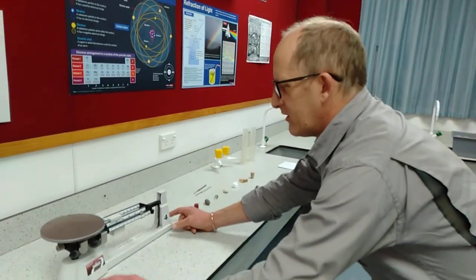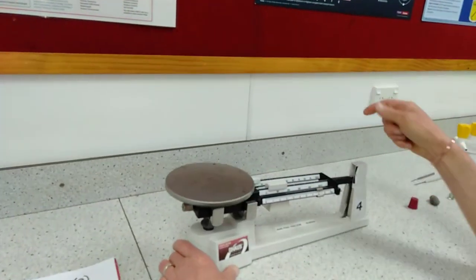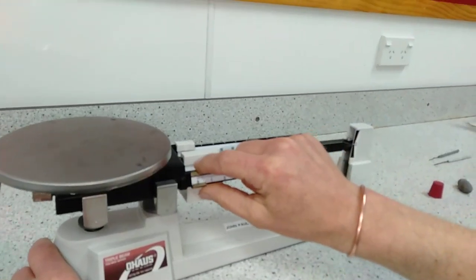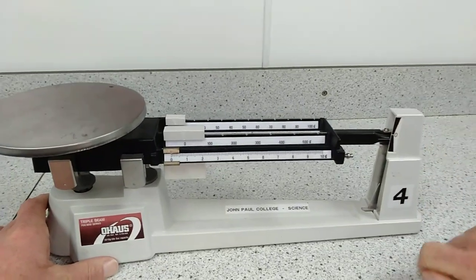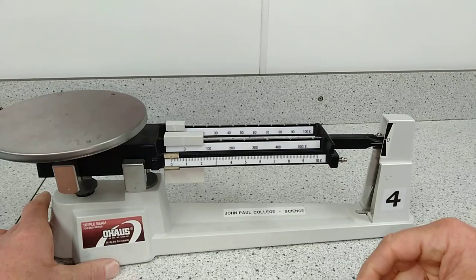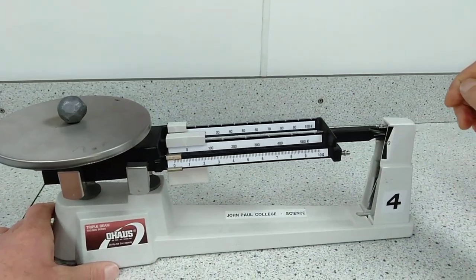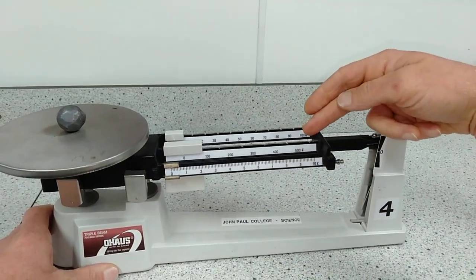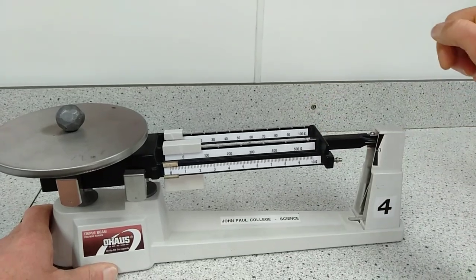To get the mass of the lead, we need to make sure that our balance is on 0 and we have the measurements aligned with 0 on this side, or at least very close to 0. We put the lead weight on and we note that it pushes it down. We need these balances, which we use the hundreds, the tens, and the ones to try and balance it out.